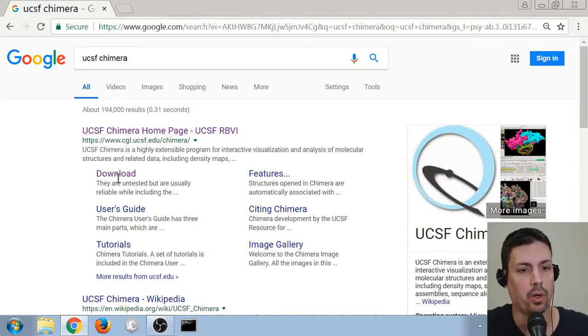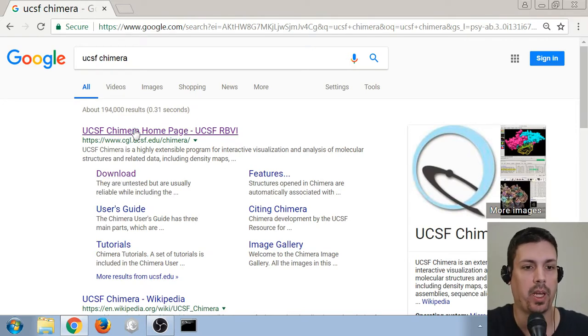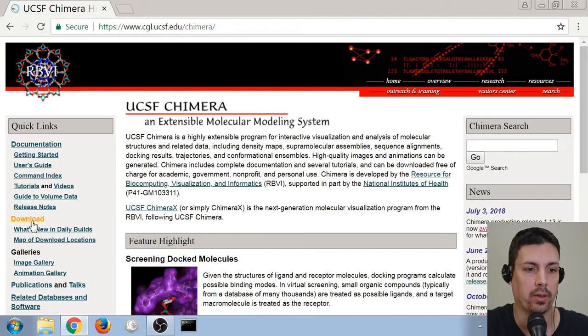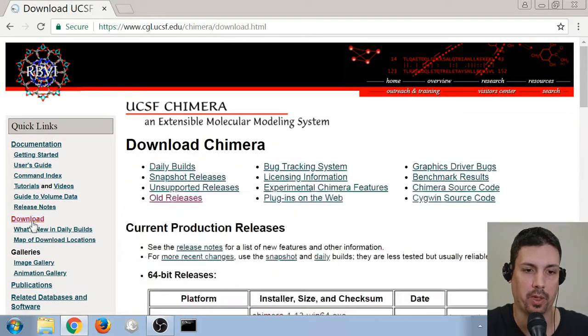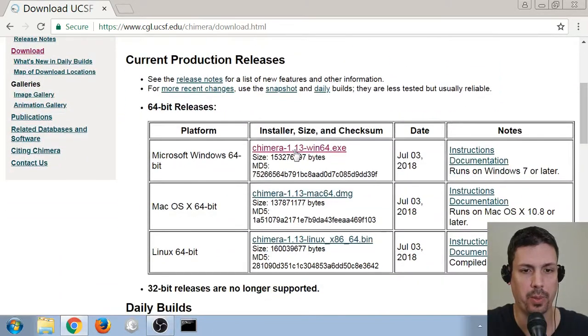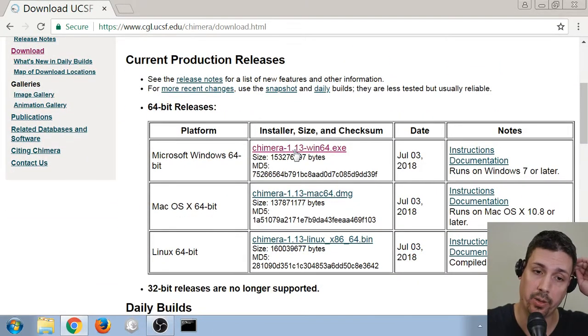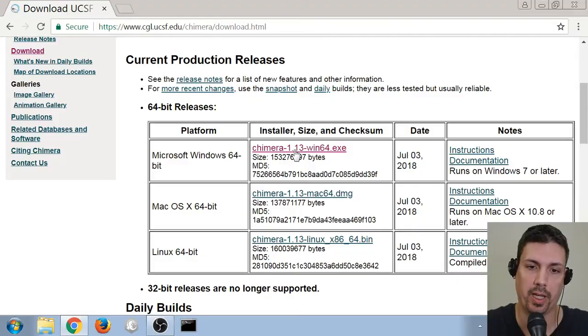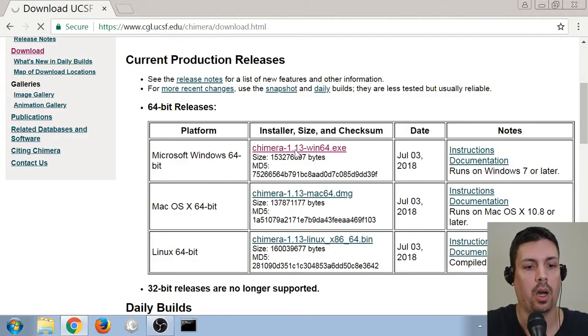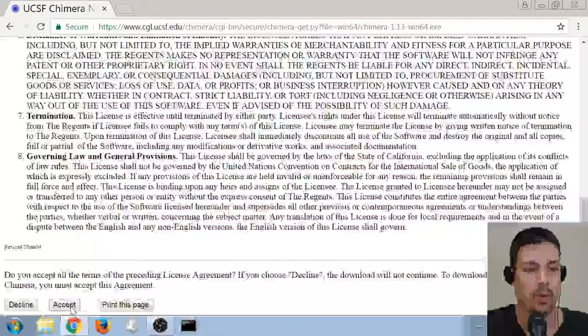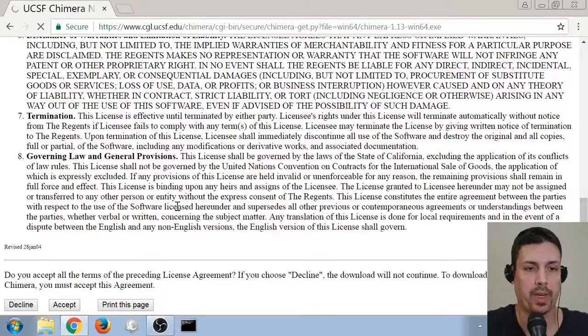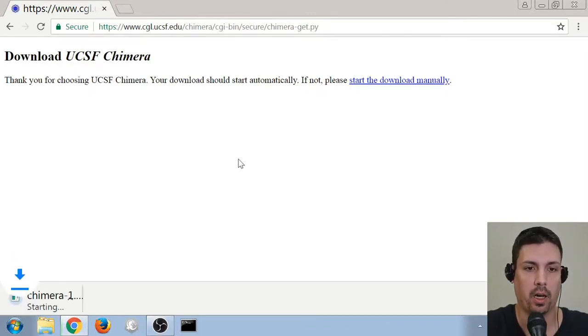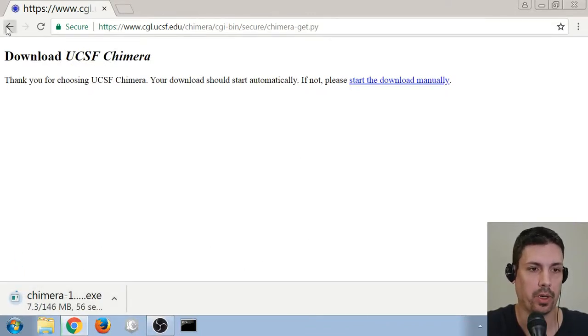So you can go directly to the download page, or you can click on the main page, and then navigate to the download page from the left menu here. For most people, you're going to download the Microsoft Windows 64-bit. It runs on Windows 7 or later. So I'll get this started here. We scroll down, we hit accept, and the download should start momentarily. I'm using Google Chrome, so the download will show up here on the bottom.